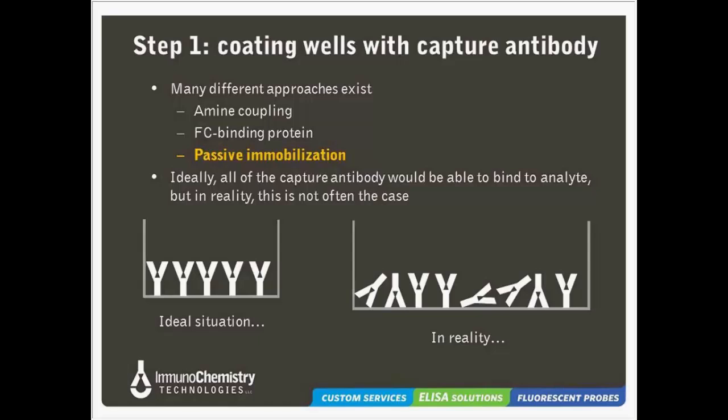The upside of this was that the low ionic strength helped the proteins or antigens or antibodies interact better hydrophobically with the plate surface, and for most polystyrene plates, you have a hydrophobic surface where they've come in after the fact and modified with radiation or some other technique to create charges on the plate. So you have not just a hydrophobic surface, but you also have a charged surface as well. So the low ionic strength was used to enhance hydrophobic absorption.